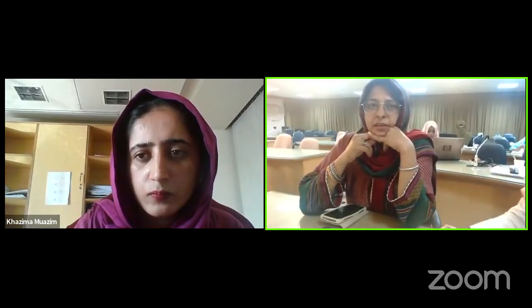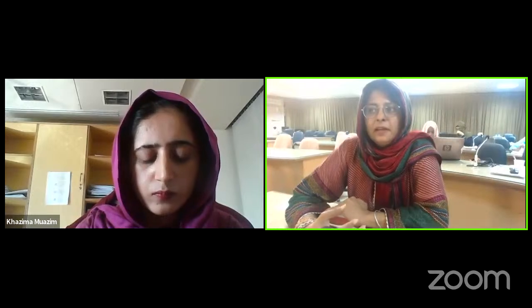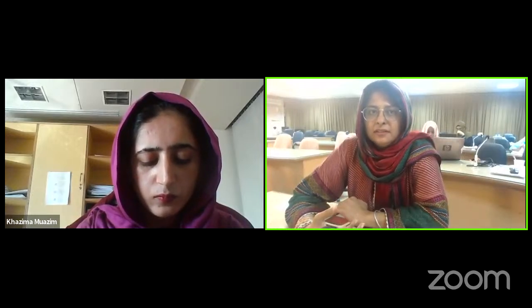Yes, Aksa, I already informed you in the chat box that plants that are grown inside the media already have the nutrients that help the plants to do photosynthesis inside the jar.